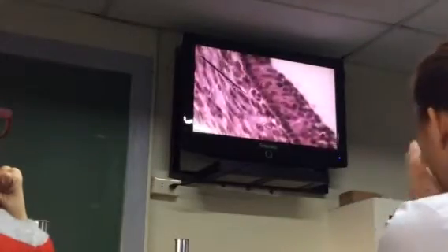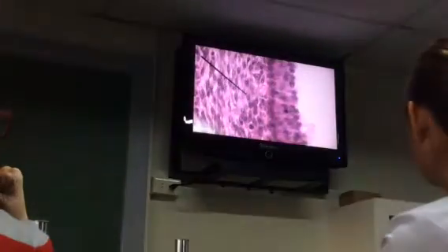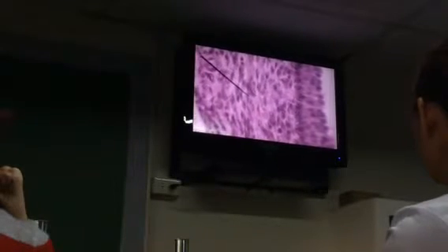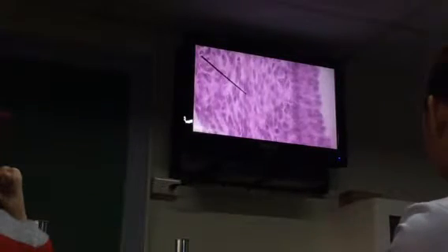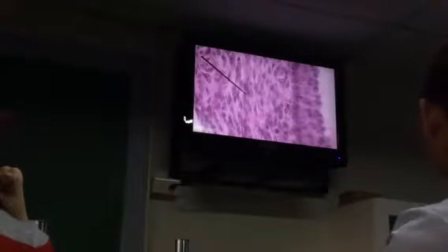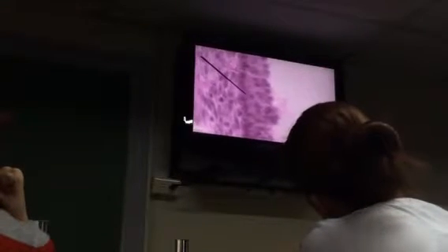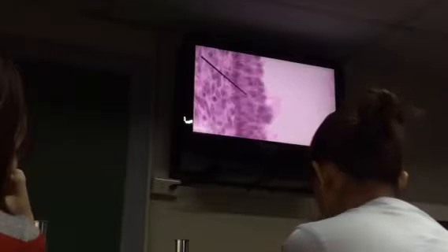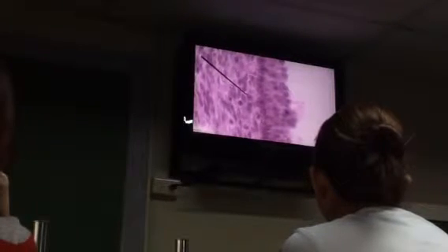Okay. Theca interna. Those are the rounded cells. Okay? Now, once you find cells that are spindle in shape, like this one here, this now represents your theca externa. And again, by the stimulation of your luteinizing hormone, we know that it is the theca interna that produces androstenedione, which is converted into estradiol by the action of the aromatase enzyme in your granulosa cells. Remember, the androstenedione passes through the basal lamina into the granulosa cells, where the aromatase acts on your androstenedione and the product is thrown back into your theca, where it is secreted as estrogen.